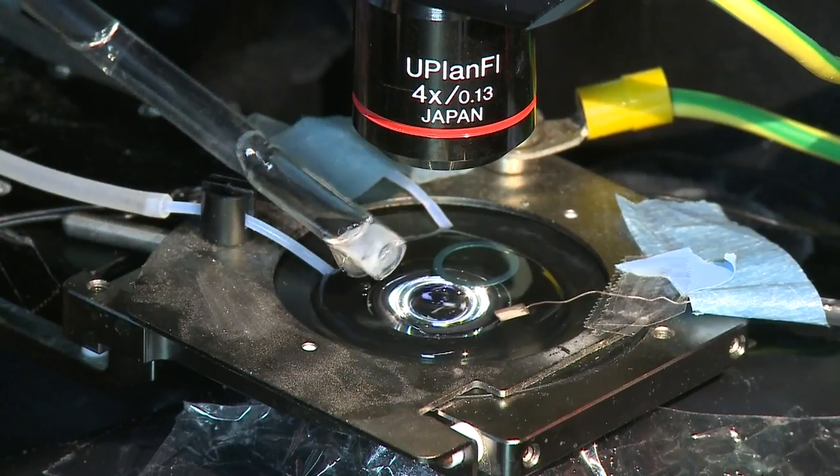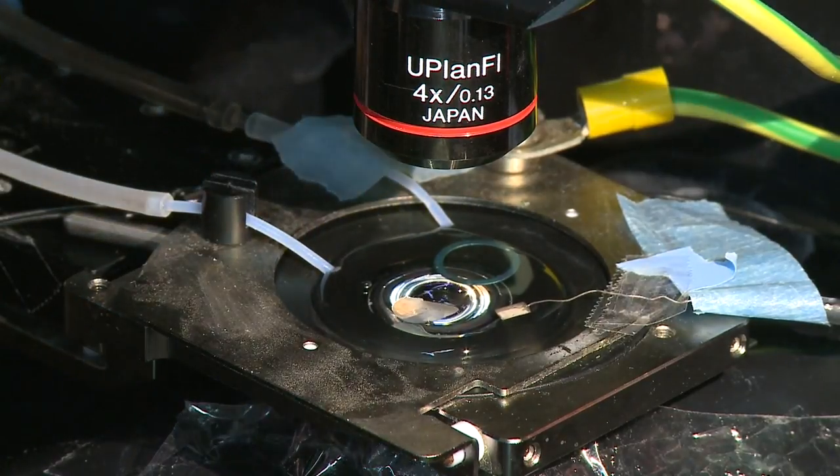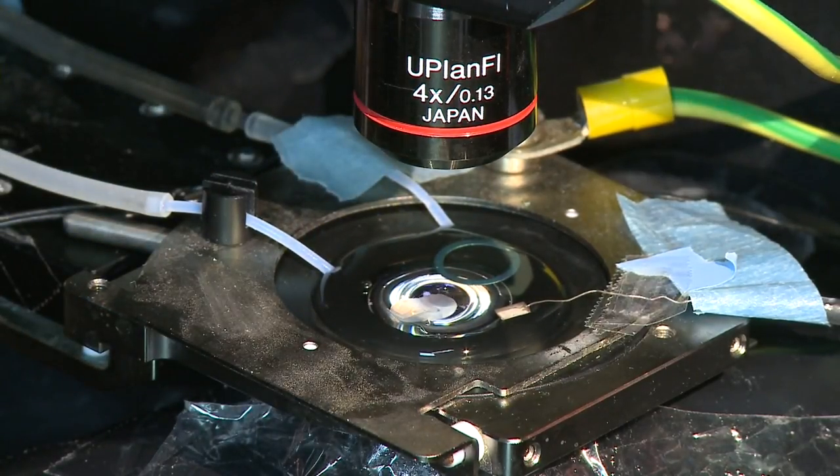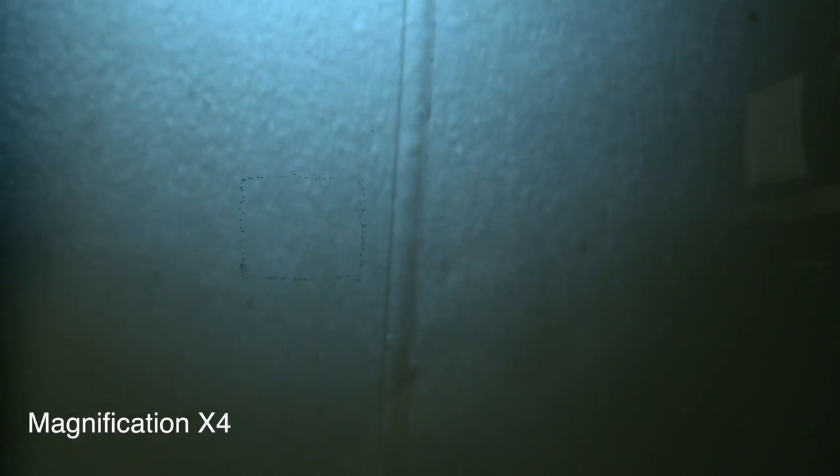We take our brain slice from the chamber filled with ACSF bubbling with carbogen and place it into the recording chamber. The chamber is superfused with ACSF. Then we fix the brain slice with the grid and start visualizing with the microscope. First, we look with the lower magnification, 4x, to see the brain region we would like to record from. Then we switch to the higher magnification, 60x, to visualize the cells.